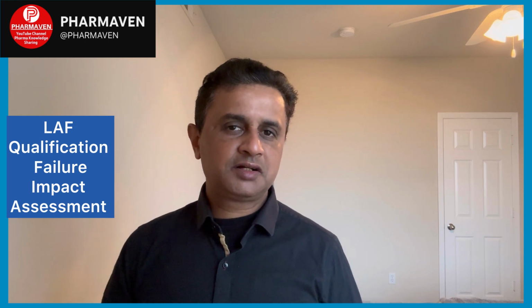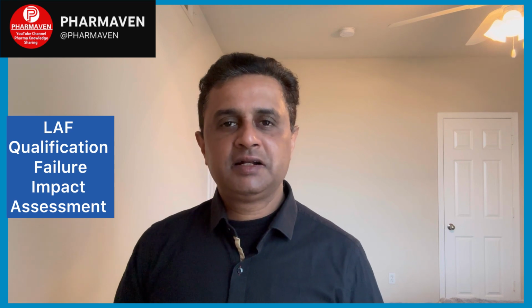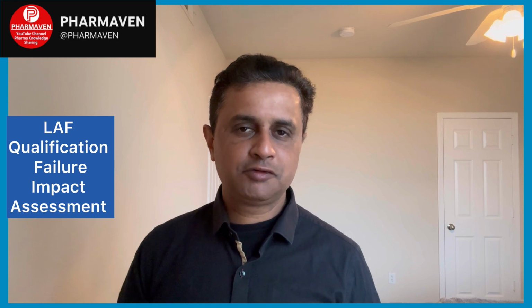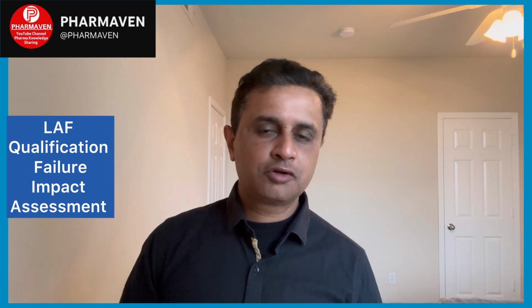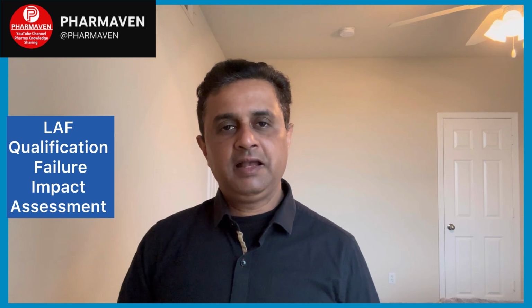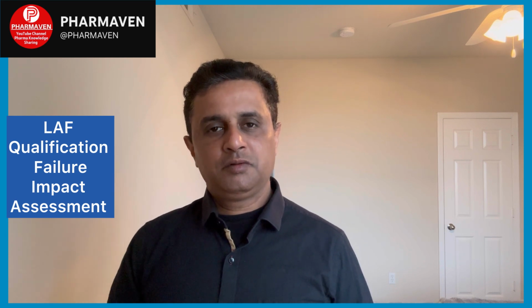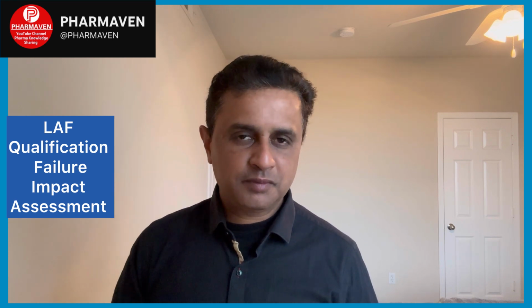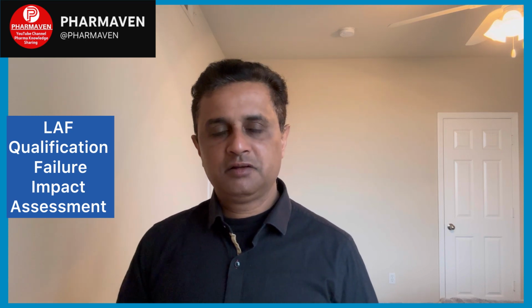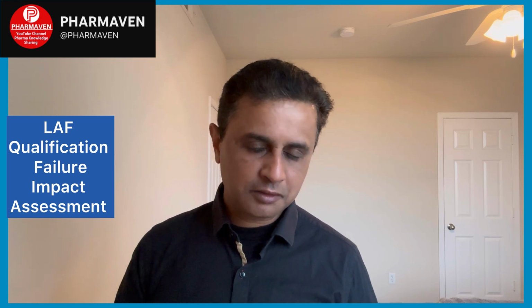But if there is a drift and there are excursions, then it indicates that the failure occurred very early and was somehow not detected in your routine environmental monitoring program, and it can have an impact on the product. So review all these details and determine whether there is a possible impact on product quality or not. This is how we can draw a conclusion.